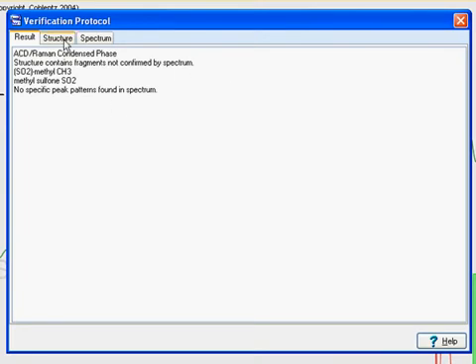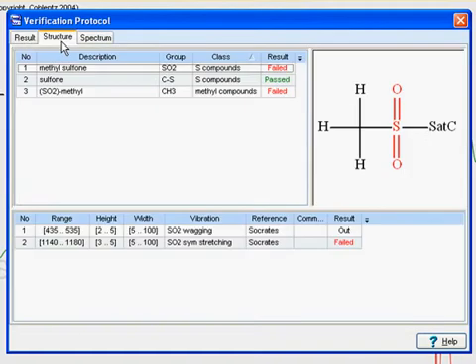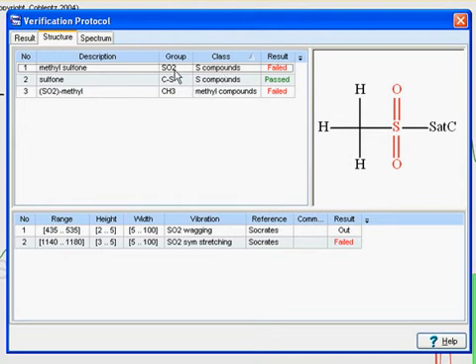We can click on the Structure tab for more details, including the specific fragments determined and their status. In this case, we have the methyl-sulfone group. One fragment being out of range, the other has not been found.